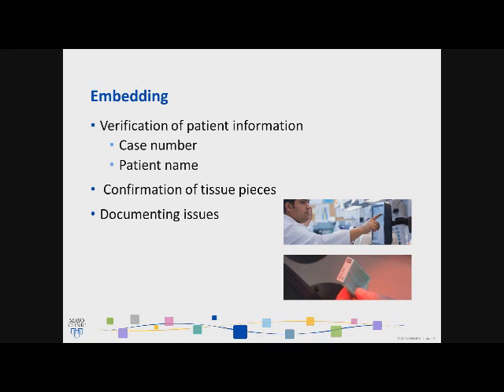Here at embedding, the other thing you can choose to do is verify patient information through barcoding. You can see here, and we don't want to endorse any type of company, but through barcoding, which can be any specific vendor, you can scan the case at embedding, which can then pull up that patient information: the patient name, medical record number, date of birth, session number, or any other patient ID can be pulled up to verify that it is that case.